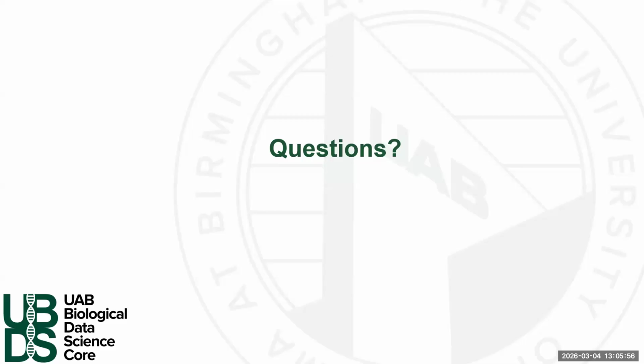Yeah. Do you think there is a chance of adding machine learning to the pipeline, which would mainly be used for classifying isoforms or read errors, mainly for differentiating splice variants from sequence errors? Yeah, no, that's a good point.